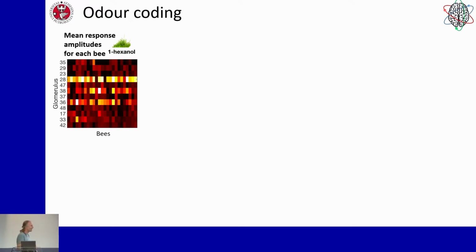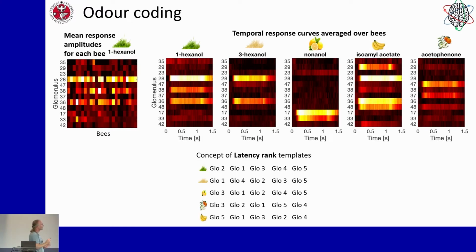Two-photon microscopy now allows us to not just look at average activity, but to time resolve this activity. And what we see here is now the average over the subject, but the time dependent pattern. So at 0 here, we are starting our odor pulse, and it stops at 1 second, and we now wanted to see whether there's some information in that time behavior.